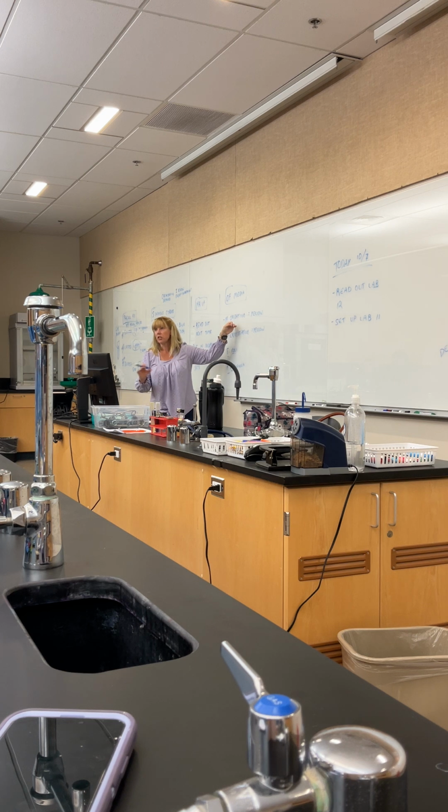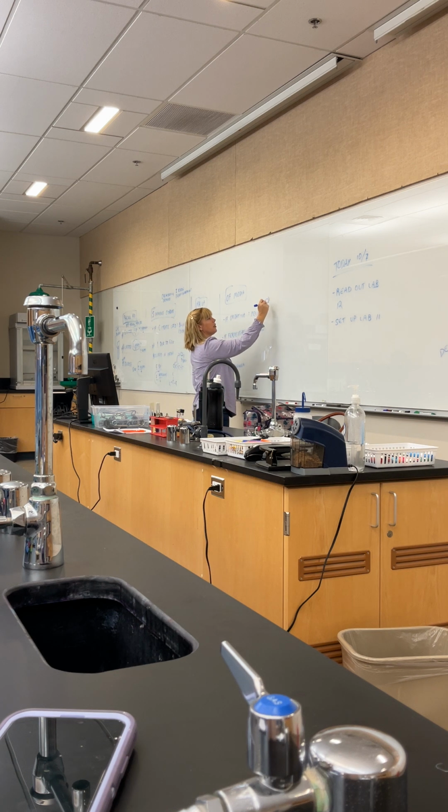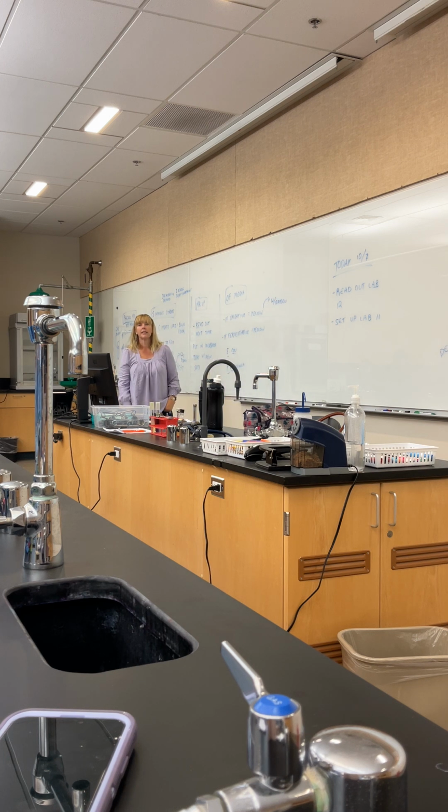Okay, I know oxidation reduction doesn't really have anything to do with oxygen. In this case we're using oxidation, losing electrons, meaning the glucose and sugars are being broken down, and we're getting a pH shift. So if I turn yellow with oxygen, then that means that I'm positive for an oxidative reaction. Okay, oxidative, not oxidation, but oxidative.